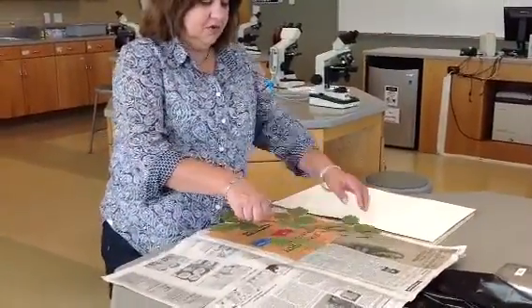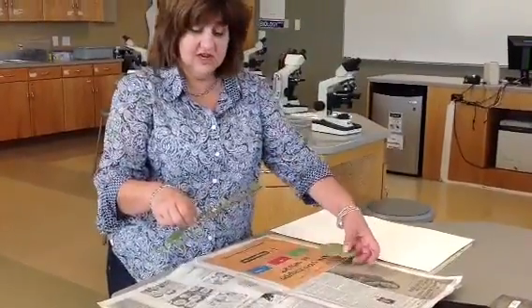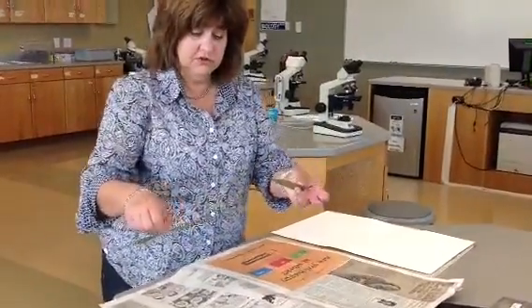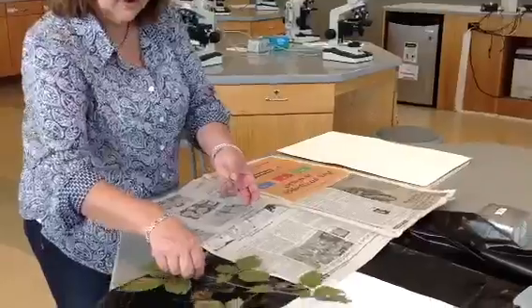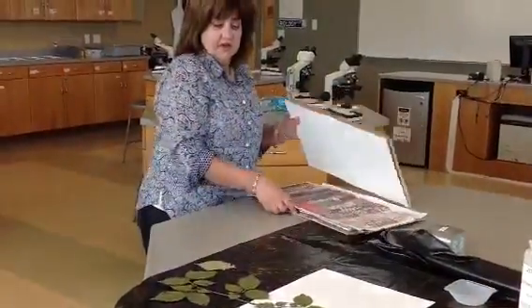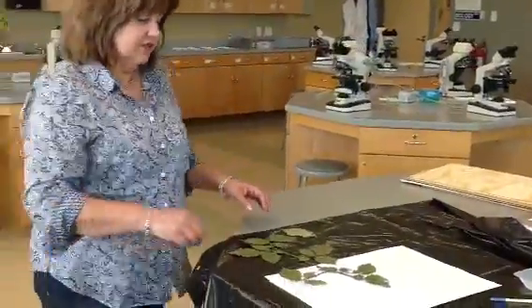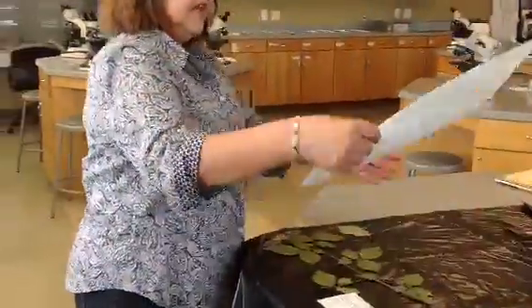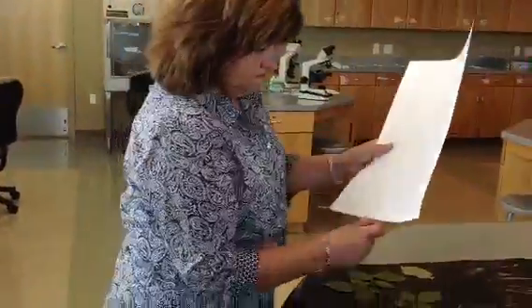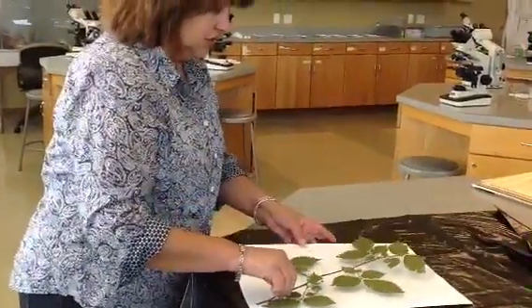I'm going to remove the sample from the newspaper. I have a leaf that fell off, but that's not an issue — I can still use this. So I'm taking this sample out of the press, and I have made sure before I got to this point that the sample was going to fit onto my herbarium sheet. So I now have my herbarium paper and the sample that I'm going to attach to the herbarium sheet.